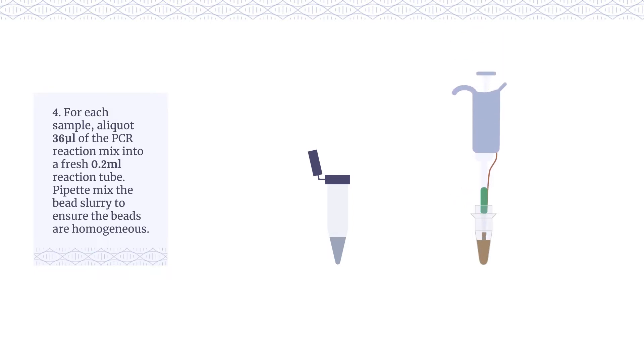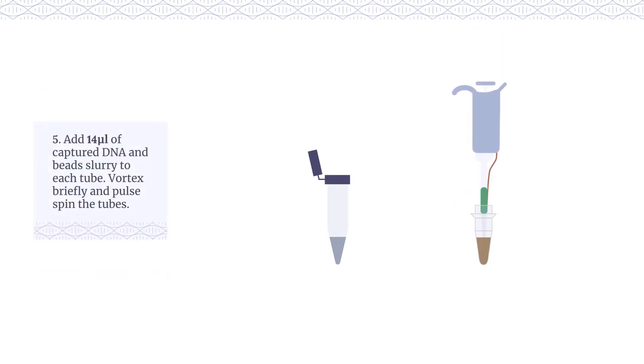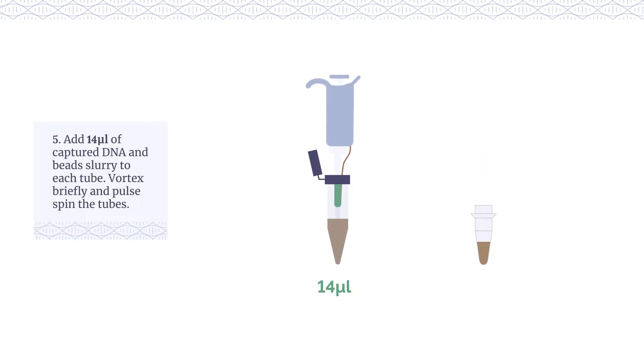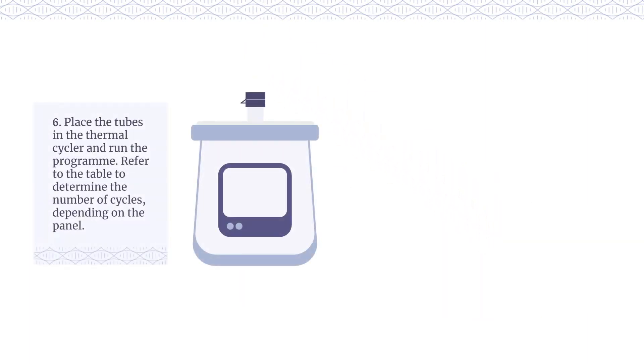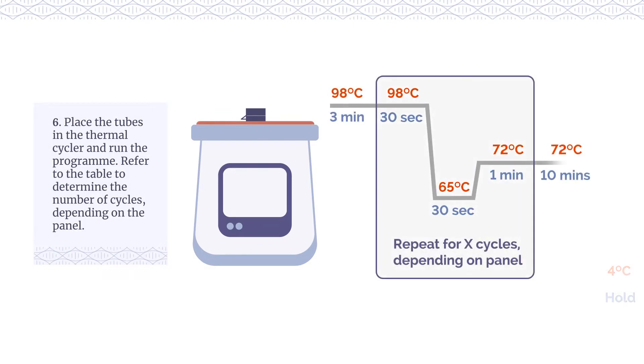Pipette mix the bead slurry to ensure the beads are homogeneous. Add 14μL of captured DNA and bead slurry to each tube. Vortex briefly and pulse spin the tubes. Place the tubes in the thermal cycler and run the program. Refer to the table to determine the number of cycles depending on the panel.